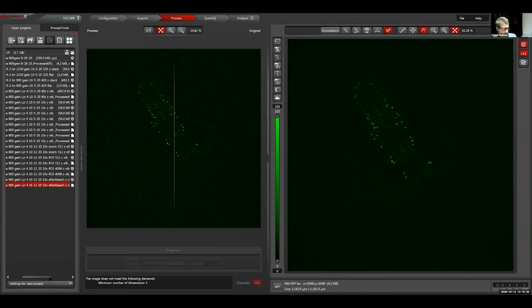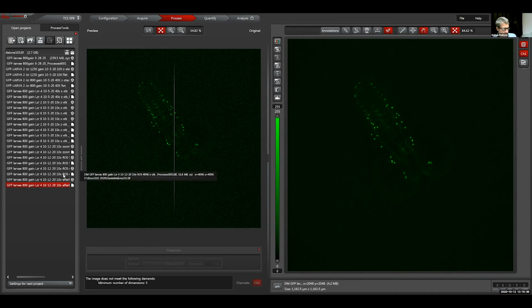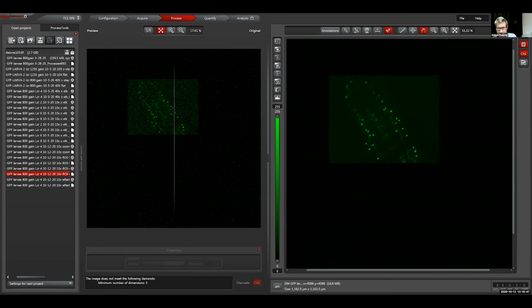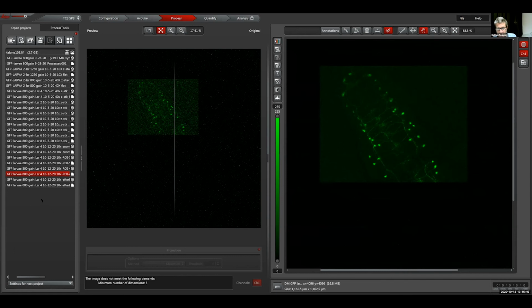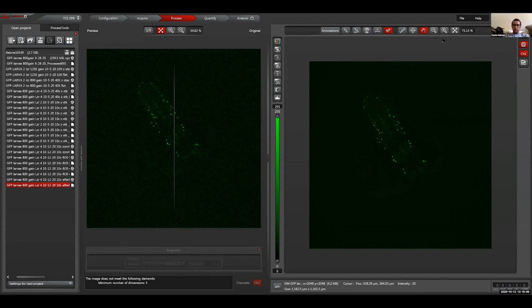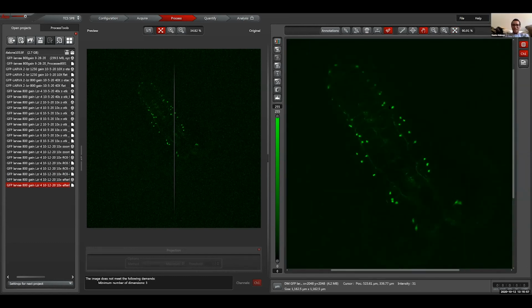So no, it didn't care at all, did it? It did not care. If we compare it to that region of interest, it was this one, right? Yeah. I have to zoom in here, but that compared to that, yeah. It didn't care. Did not phase it. Didn't do anything. All right. Bring it on, it says. Can't teach me. Okay, well, there we go.